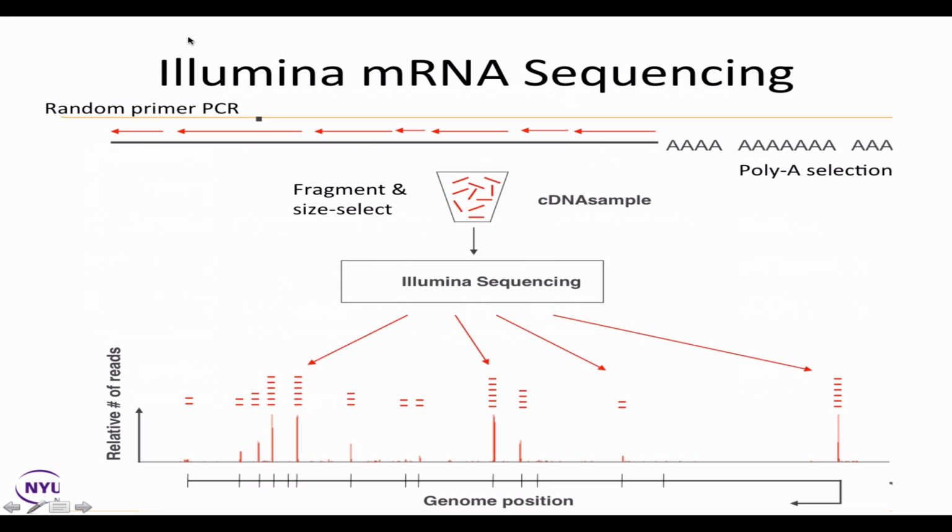After your sample is prepared, fragmented, and loaded onto the Illumina sequencer, it's delivered to you or us, the informatics group, as a set of files in a format called FASTQ, at which point we do an alignment. We match each sequence to the appropriate location on a reference genome.